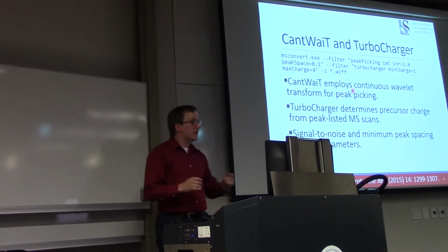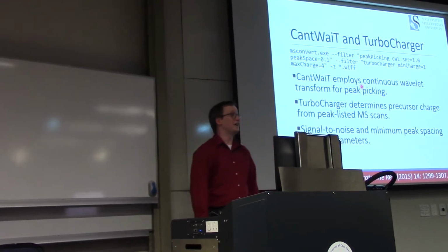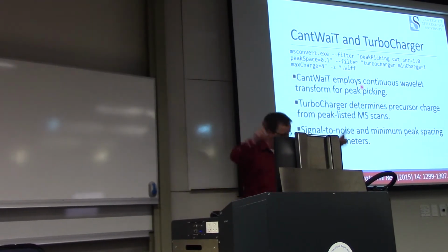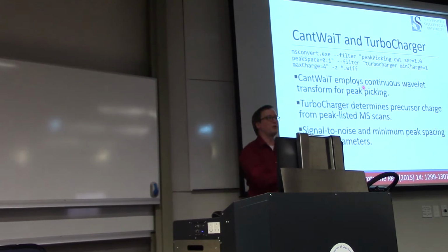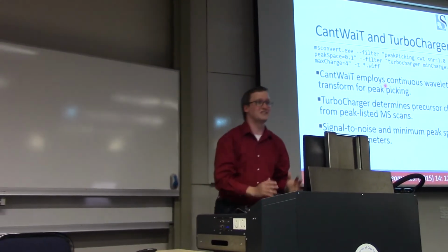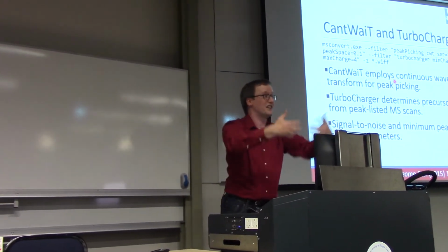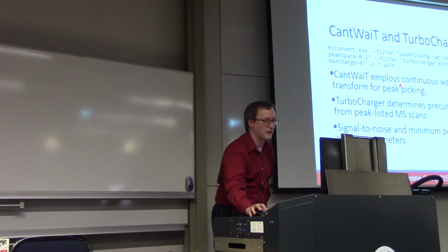Do you need to understand what the continuous wavelet transform looks like? No, we're not going to get into that. But we start from these Mexican hat wavelets, and we look for whether you need a big one or a small one, where it needs to be positioned, etc., in order to turn that into a set of wavelets, thus a set of peaks that can be matched to the spectrum.